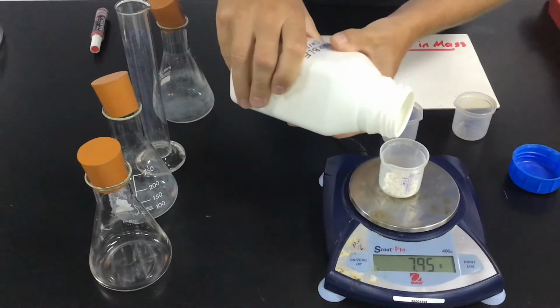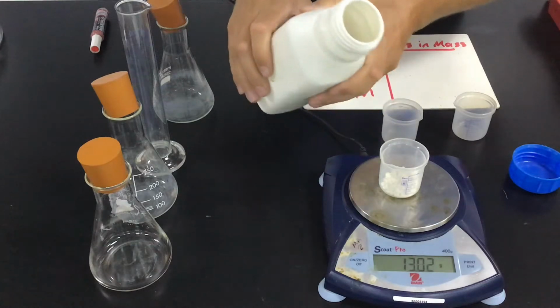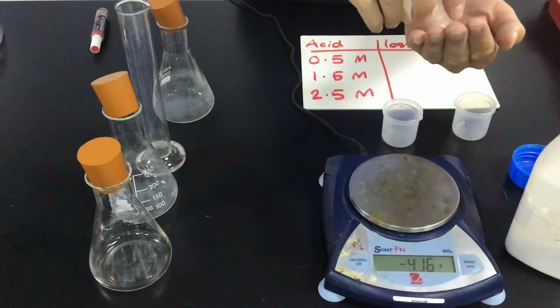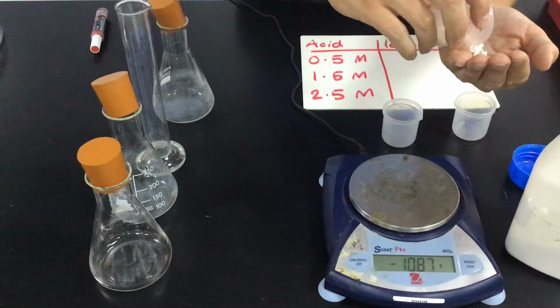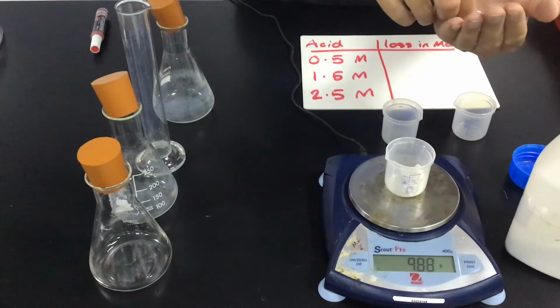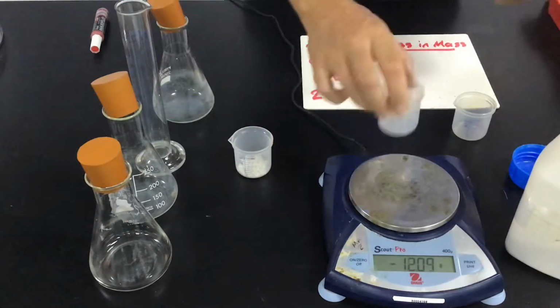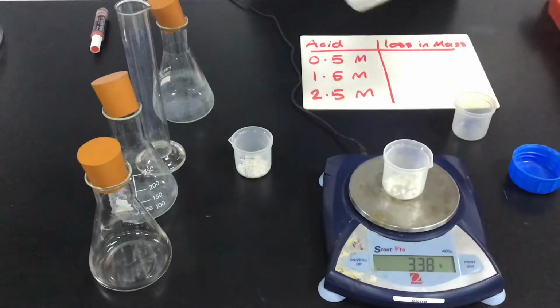We're going to have 10 grams, that's nearly 8, and that looks pretty much right. Way too much. Swab it out. We're looking at 13 to pour out some chips. 10.97. 9.88. Let's add a small one. 10.03. It's not going to get much better than that. 10.03. I'll pour them into my hand actually.